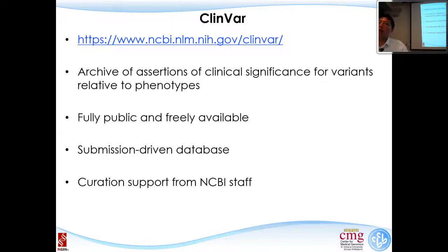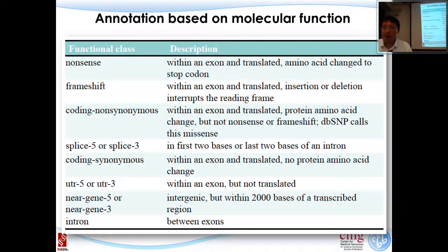Some of them, although they are not specifically independently validated, have been reported by more than one clinical laboratory, so those are the ones that potentially have more confidence. But some of them have conflicting results. So you will see all that information in the report. You can choose to believe one way or the other. So those are the annotations based on the population or based on existing databases.